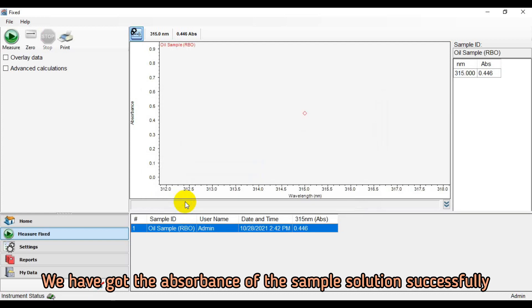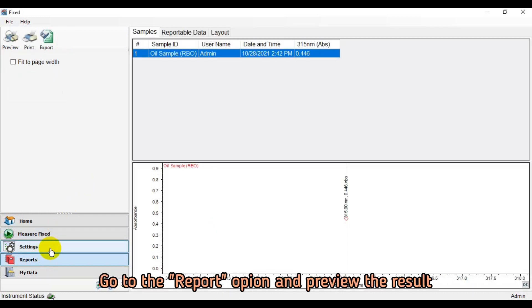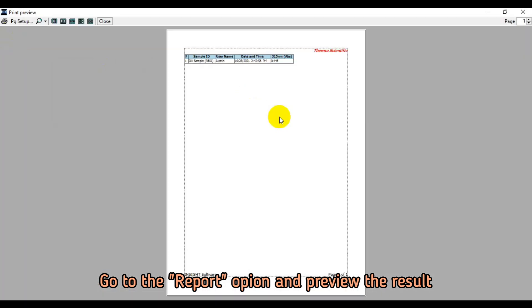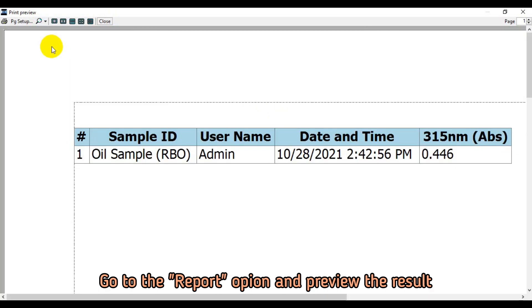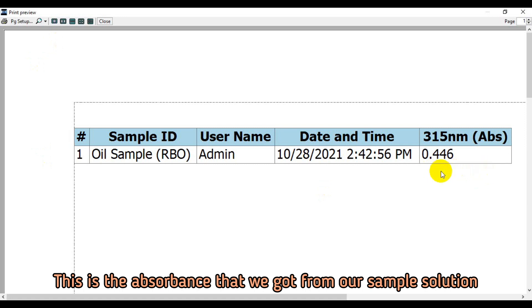We have got the absorbance of the sample solution successfully. The absorbance values recorded must lie within the range 0.3 to 0.6. If not, the measurements must be repeated using more concentrated or more diluted solutions as appropriate. Note the absorbance.